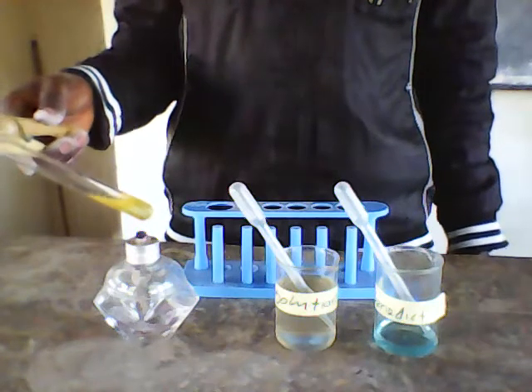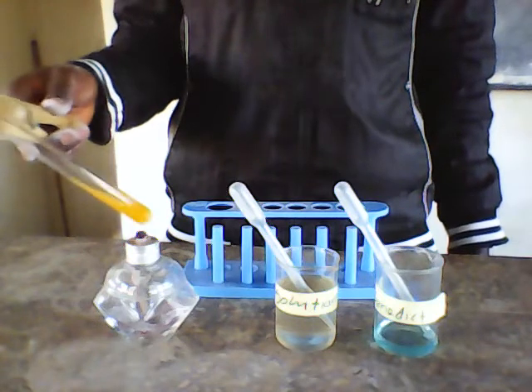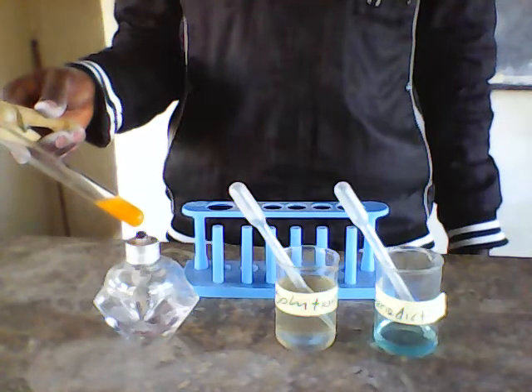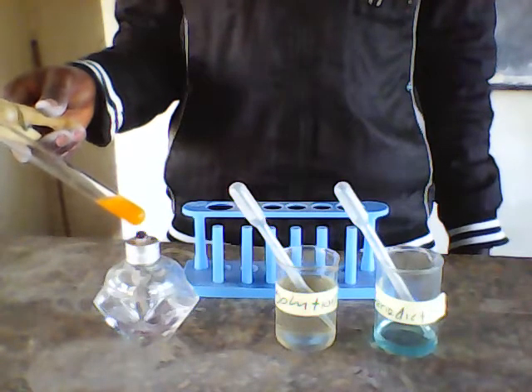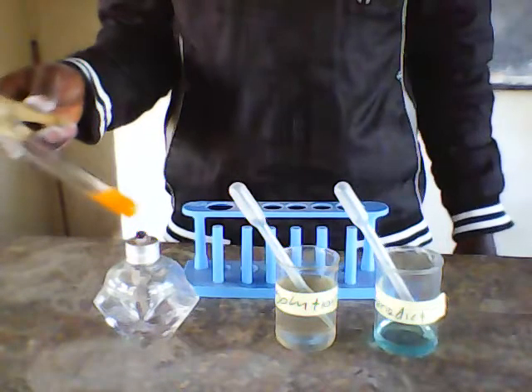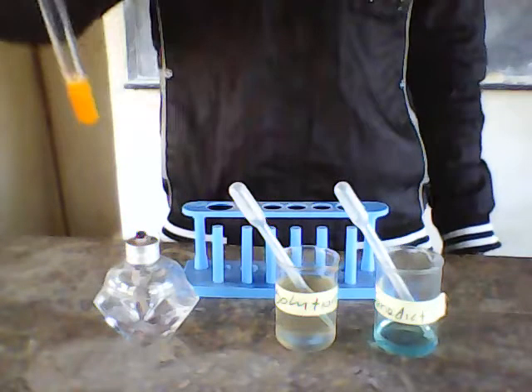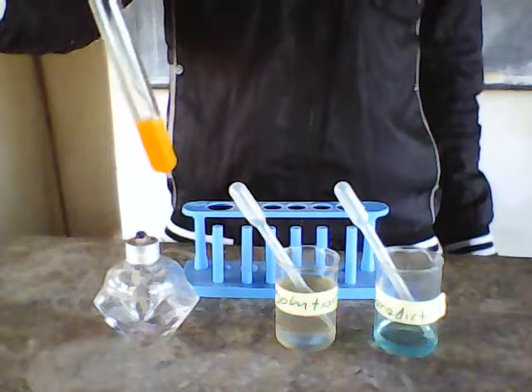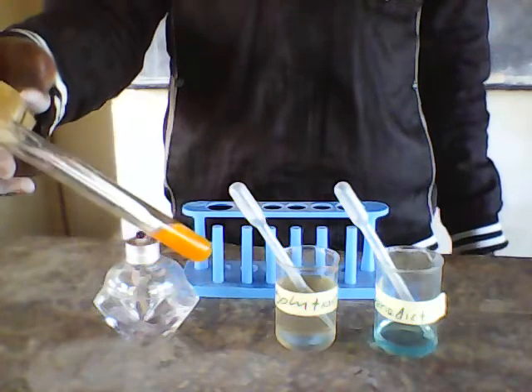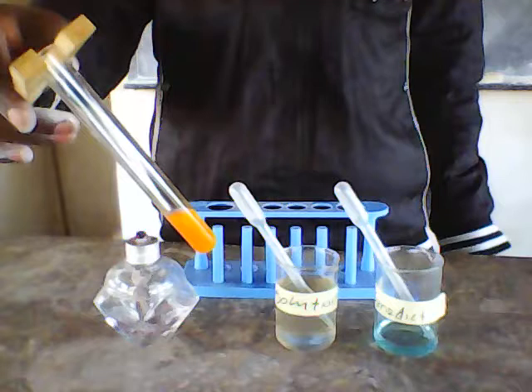As you can see, my solution in the test tube has started to change. As you can see, I have the orange color in the test tube, and this shows that the reducing sugars are present in solution X, or are present in the solution that contains sugar in water.